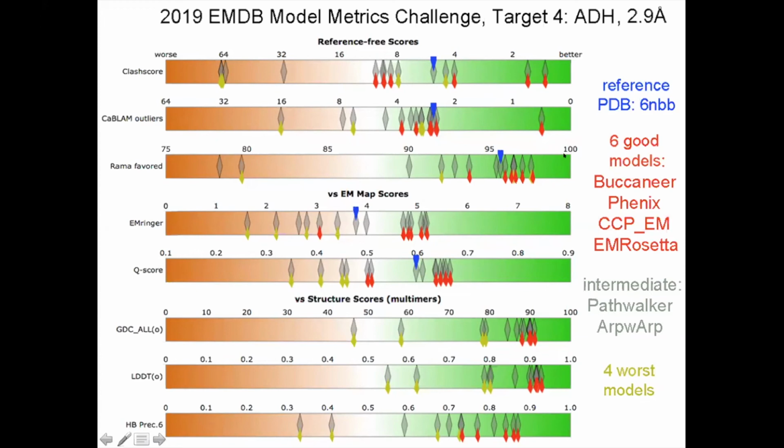And I'm not going to try and explain what the sliders show, but the outcome of that was that there were 5 or 6 different standard methods that do quite a good job at 3 angstroms, and Phenix is one of them. You will definitely get a good overall structure, and it gets a long way toward getting the details right. We're not sure anybody can do that at 3.5 or 4, but maybe they can by now. Methods in cryo-EM in general, including validation methods, change so fast. Every month you have different new tools that are better.